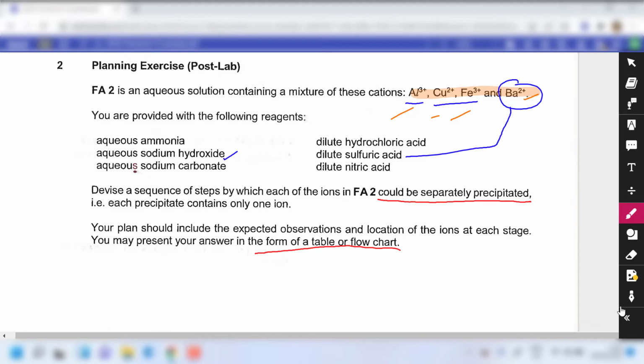But again, there's no right or wrong answer. So we'll try to see whether we can perform the separation in pairs first. Because if we can do that, then I think that is probably something we wish to follow. Okay.